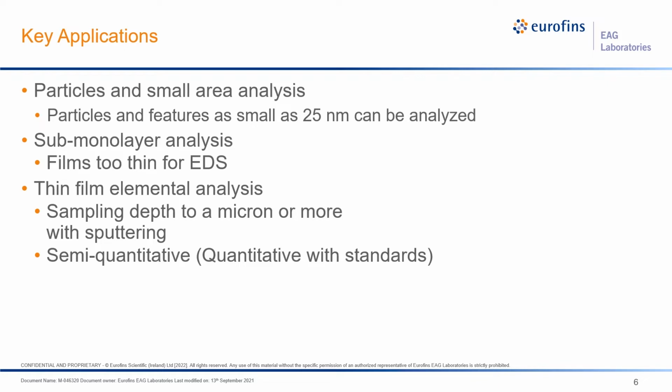For very thick films, it may be more efficient to prepare a cross-section by mechanical polishing or with an FIB, and take advantage of the very small spot size of Auger to analyze the thicker layers in cross-section. In this way, we can also provide compositions versus depth, much like a depth profile, but this time using an Auger line scan across the features of interest. The Auger line scan is a plot of concentration versus distance across an image.